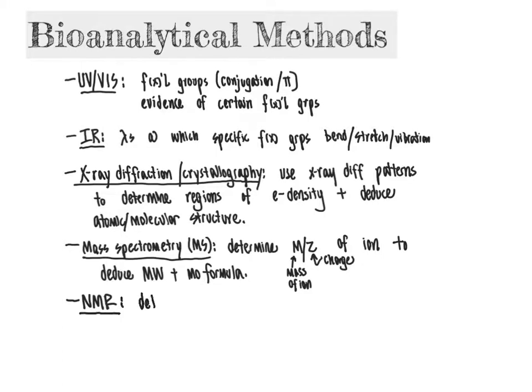So specifically, we're going to be detecting nuclei that are able to participate in this phenomenon of magnetic resonance, which is 1H, meaning the most abundant isotope of hydrogen, carbon-13, not the most abundant isotope of carbon, but still prevalent enough for detection in many cases, nitrogen-15, phosphorus-31, and there are other atoms that are suitable for this nuclear magnetic resonance as well.